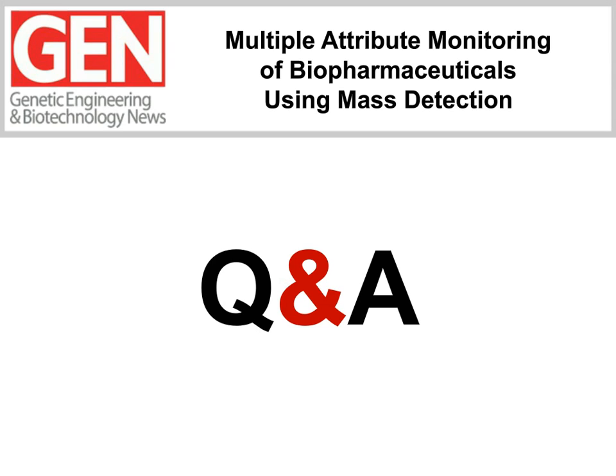So we've used RapiFluor MS not only for the routine monitoring, which is what I discussed today, but also in the characterization workflows. And what we've seen is that in the characterization workflow, not only do we have dramatically improved MS sensitivity for doing full scan MS, but the improvement in sensitivity also carries through to doing the MS-MS analysis and doing more detailed structural characterization of the glycan structures.